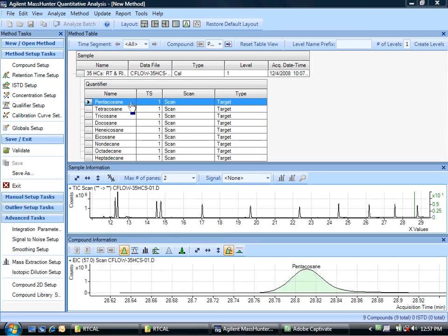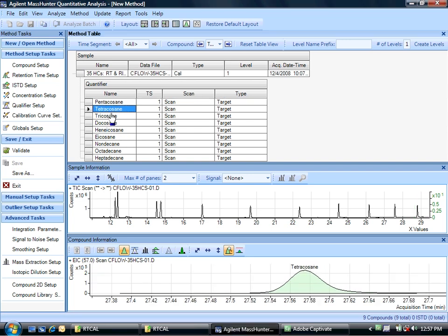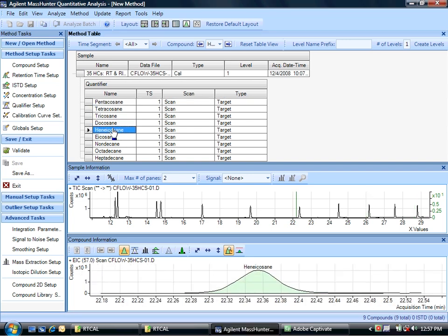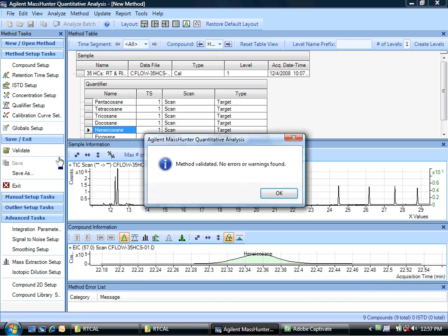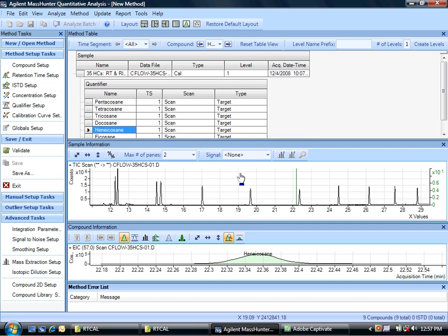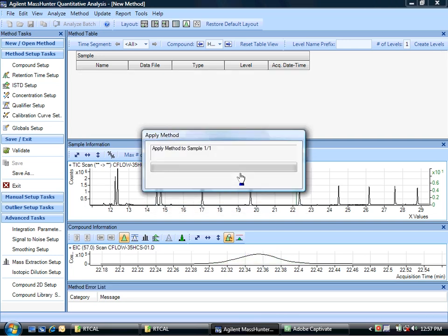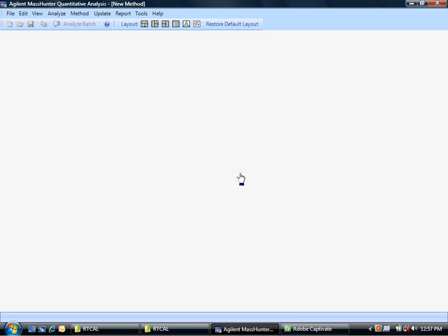Alright, here I am with a small method. I've got my hydrocarbon series here, and as you can see it finds them. I've made a small method. I've put in a very tiny one-point calibration curve to make sure it's a valid method.